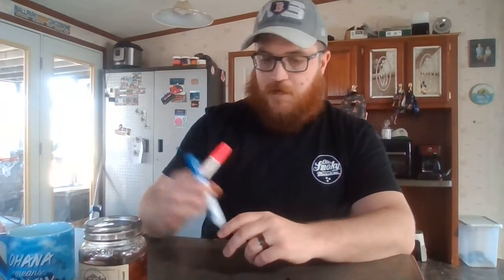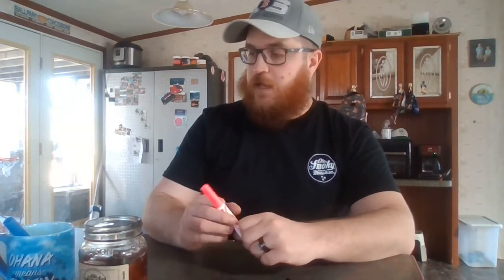So what I would start by doing is labeling this new tube before I put the broth in. It would be my name or initials typically, what medium we're using to grow that bacteria in, as well as what bacteria we're trying to grow. So I would go ahead and do that.